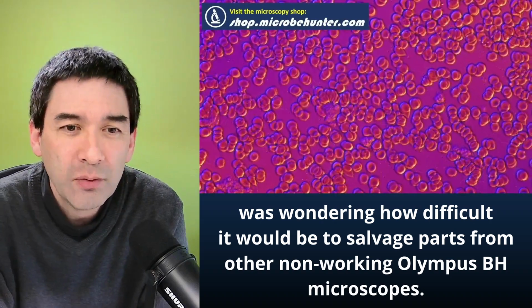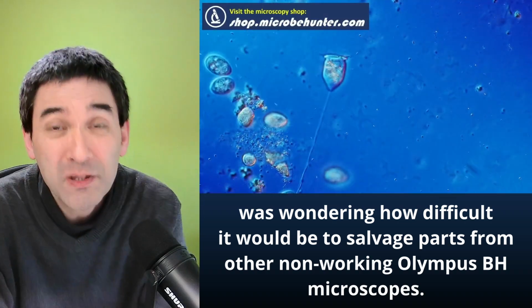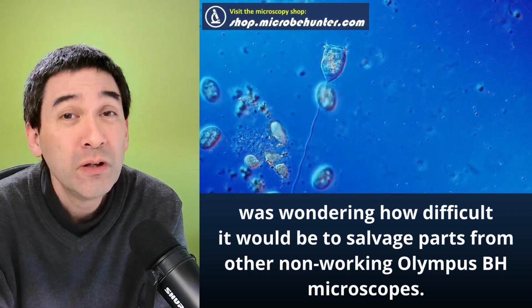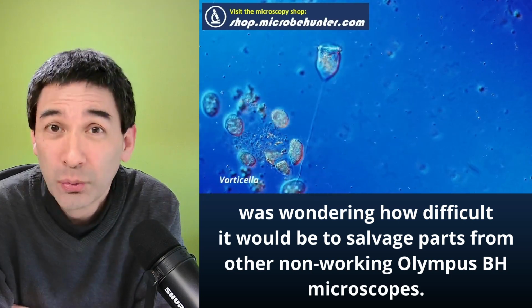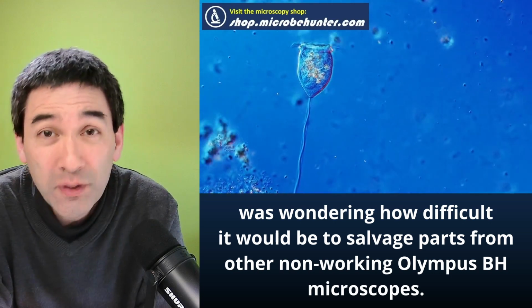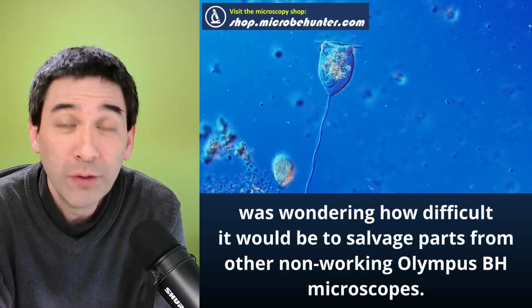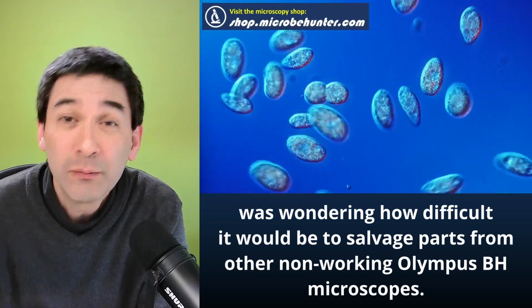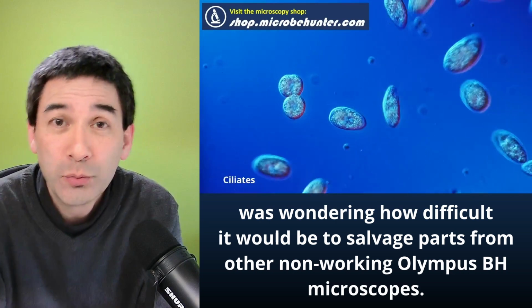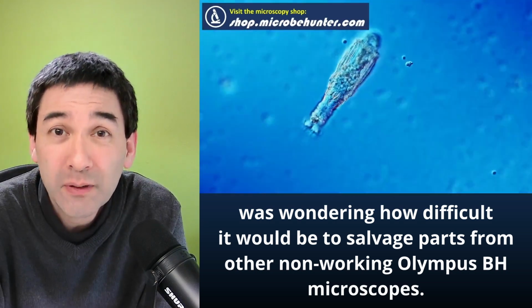Those brand microscopes from the 1970s and 1980s, like the Olympus BH2, were extremely popular and manufactured in quite large quantities, not only by Olympus but also by other brands like Zeiss. The Zeiss Standard, for example, had a highly modular design, and with a fairly large second-hand market, it is indeed possible to put your own microscope together. However, and that's maybe also important, it does not mean that this is going to be cheaper.